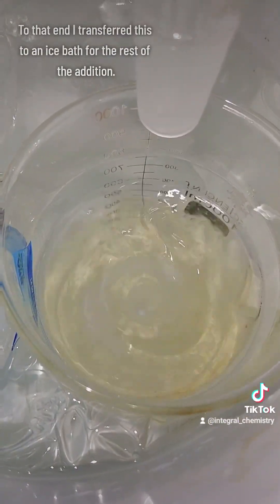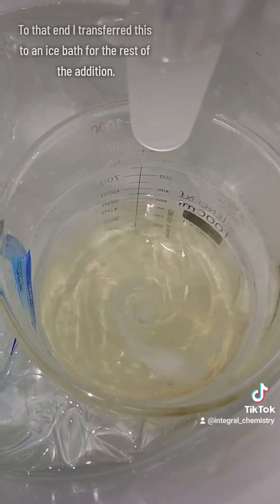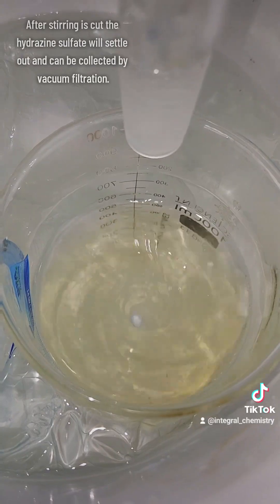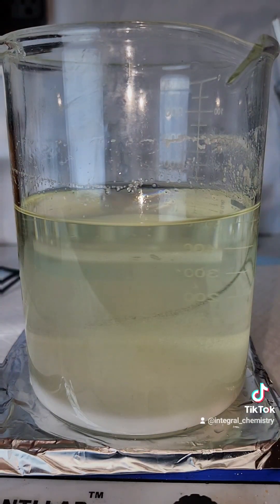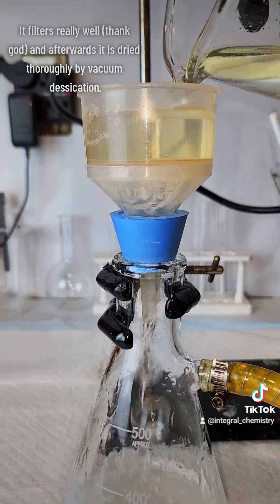To that end, I transferred this to an ice bath for the rest of the addition — and this video is in real time, so this is how fast my additions were. Once the addition of sulfuric acid is complete, I cut the stirring to allow the hydrazine sulfate to settle out, which can then be collected by vacuum filtration. After the vacuum filtration, my product is transferred to a drying dish and dehydrated in a vacuum desiccator for about 24 hours.